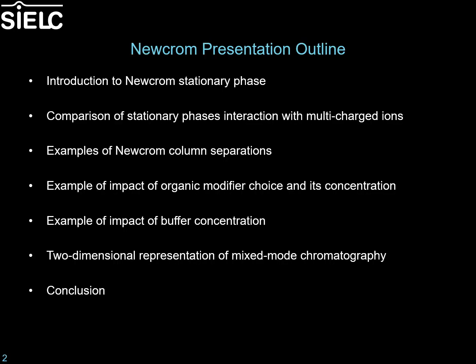This presentation is going to follow this general structure. First, we'll have an introduction into the nature of the Newcrom stationary phases themselves, a comparison of stationary phase interaction with multi-charged ions, and then different examples of the different Newcrom columns used in separations. We will also go over the impact of the organic modifier choice and its concentration, as well as examples of the impact of buffer concentration when all being used on Newcrom columns. And then finally, we'll go over a two-dimensional representation of mixed mode chromatography itself.